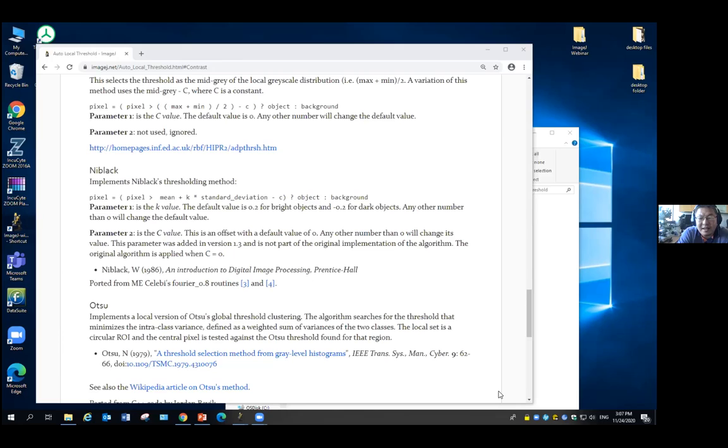Your image analysis and your image acquisition should start at the same time. When you analyze your image, you realize something may be wrong with it. That helps you optimize your image acquisition process, to help you get a better image to analyze. Then by the end, you get a much more reliable, better result.